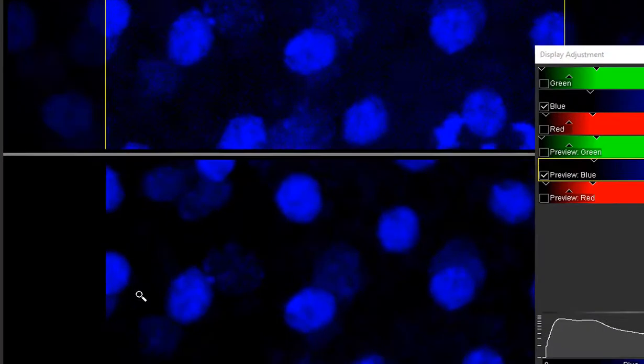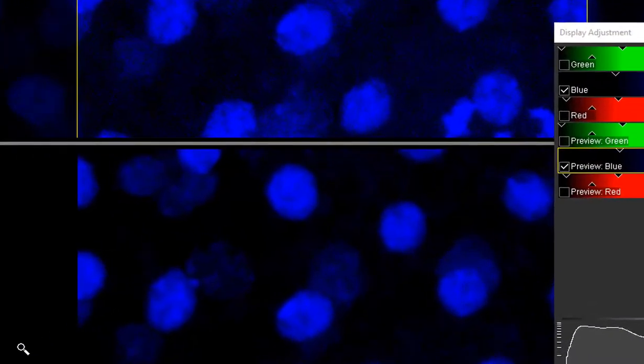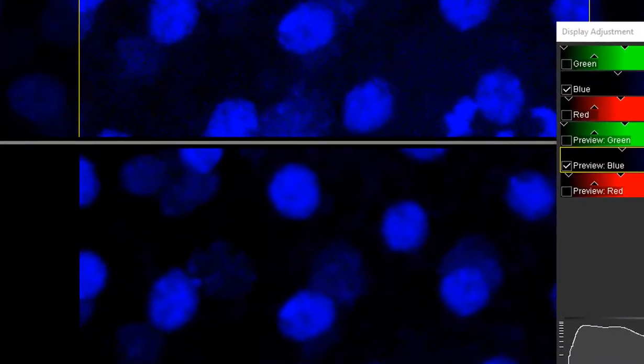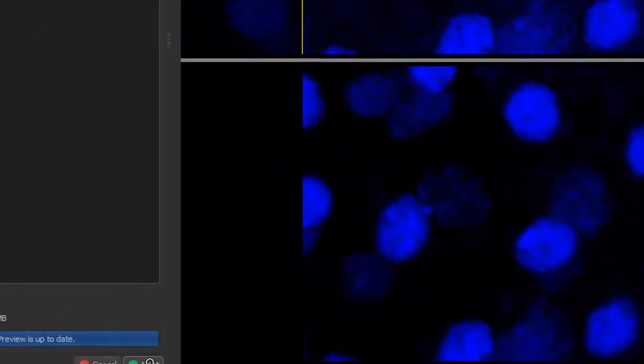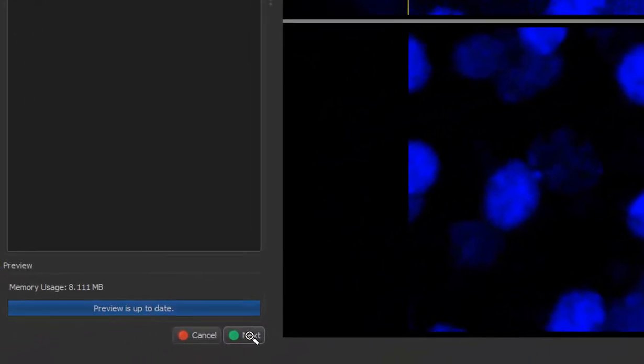Check the preview to make sure the results are satisfying. If so, press next, which takes you to Batch Setup Step 2, objects.